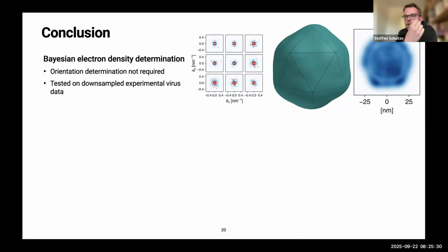But what we can do to test this is take virus data, where this has been quite successfully applied previously, and just reduce the photon count artificially. And indeed, from a 10,000 times, I think was it, downsampled data set, we can really still get the structure of this icosahedral virus and even see the internal structure.